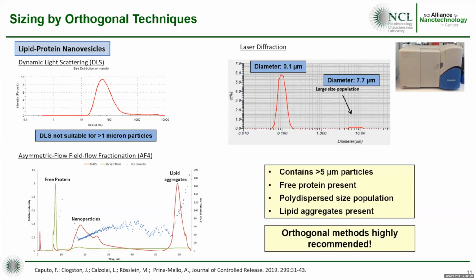So what we do is resort to a different technique, laser diffraction in this case, which is better suited to looking at larger particles. And indeed, we do see this larger size population, along with that smaller size population that we see in the batch mode DLS measurements.